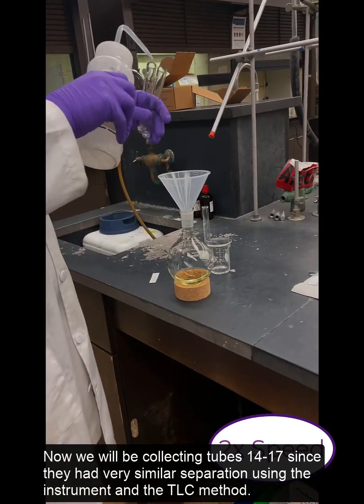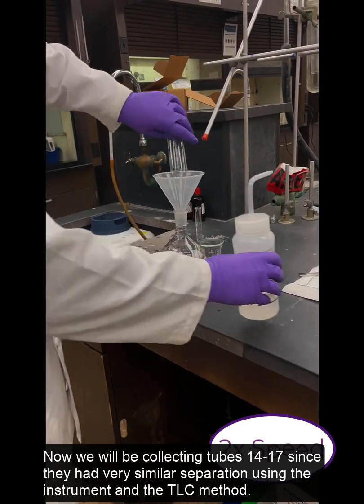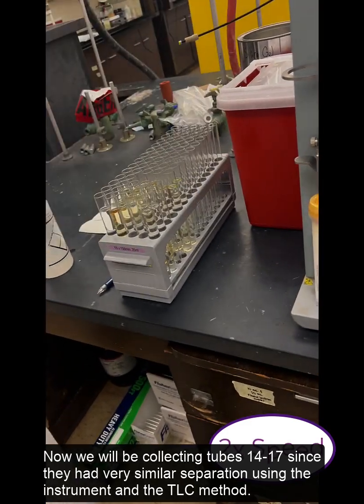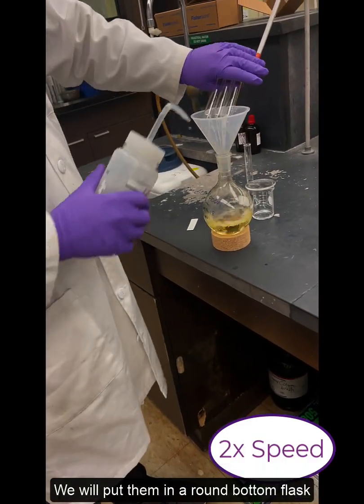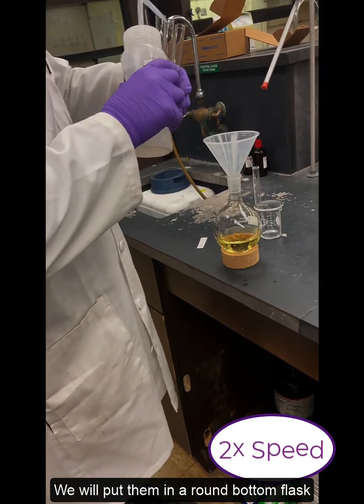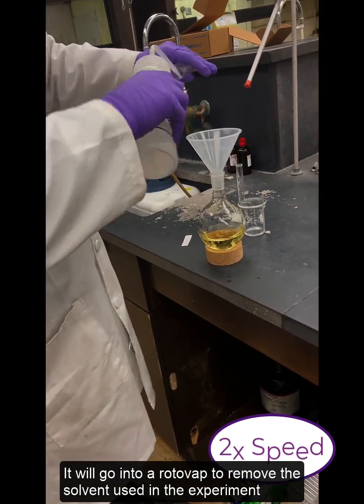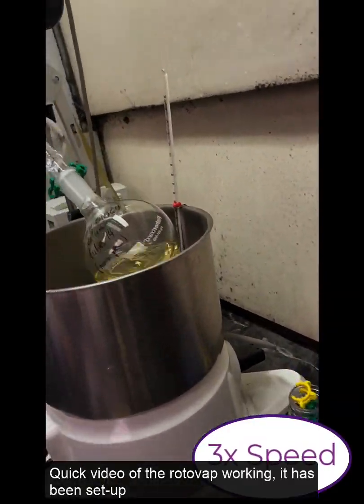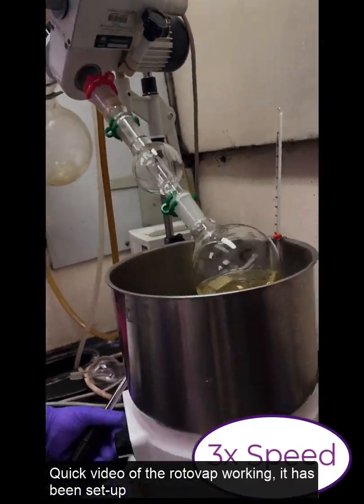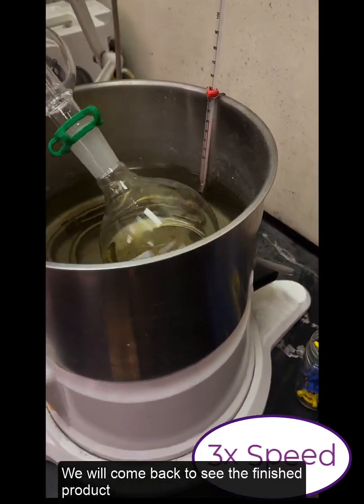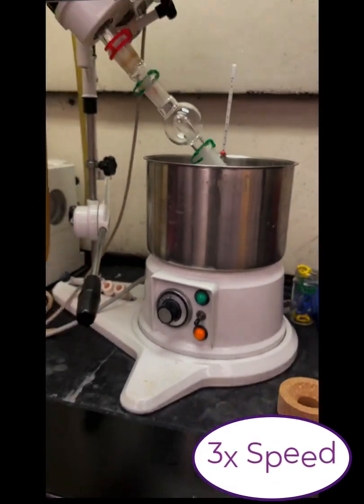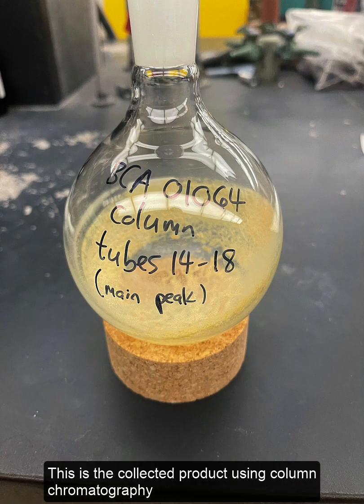So now we'll be inserting tubes 14 through 17 since they had very similar separation using the instrument as well. Using the TLC method we'll put them into a round bottom flask and into the rotavap in order to remove the solvents that were used in the experiment. This will be a quick video of the rotavap working. It's been set up and we'll come back to see the finished product. This is the collected product using column chromatography.